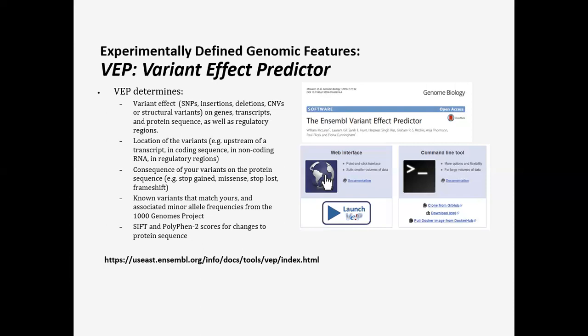And again, NIPT is only for the clinical. Research is very less. So in clinical, the more stringent you are, the better. All these ACMG guidelines are now integrated with CLC. You are done. You do not need to know.